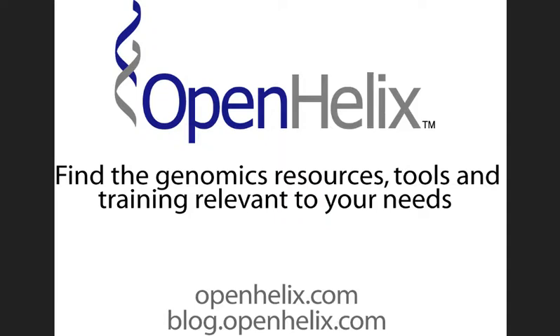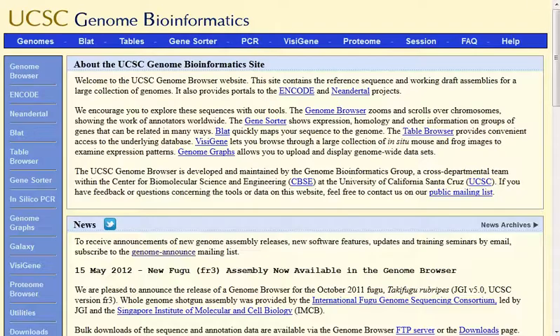For today's tip, I'm going to highlight a new data type that's been applied to the UCSC Genome browser. Now, you're probably familiar with the UCSC Genome browser. It's a way to organize and display lots of genomic information that provides context for any region that you might be interested in exploring. But they're always adding new data types. And a new annotation track that's been added is the publications track, and that's what I'm going to show you today.